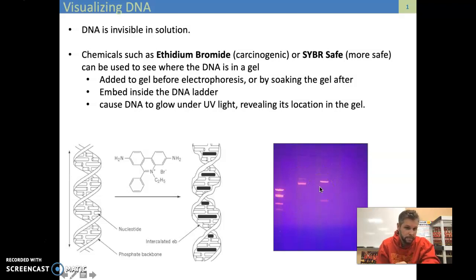That's DNA. So what we're going to attempt to do in lab this week is visualize DNA by staining it with ethidium bromide. And then what that will allow us to do is confirm whether or not you actually got DNA isolated in your invisible solution that was your output from our last lab. So hopefully that makes sense, guys. Go ahead and read through that thing.